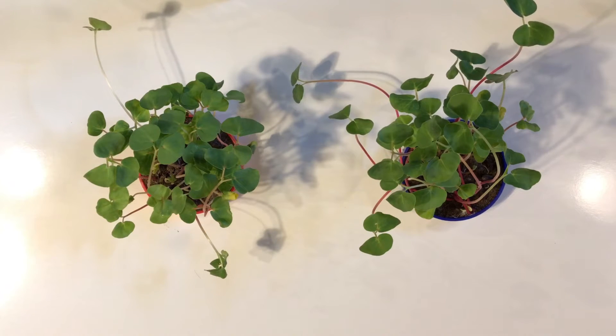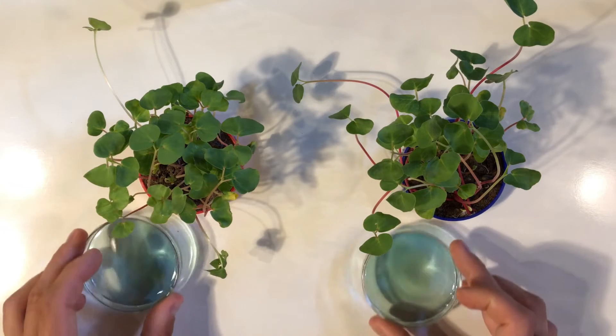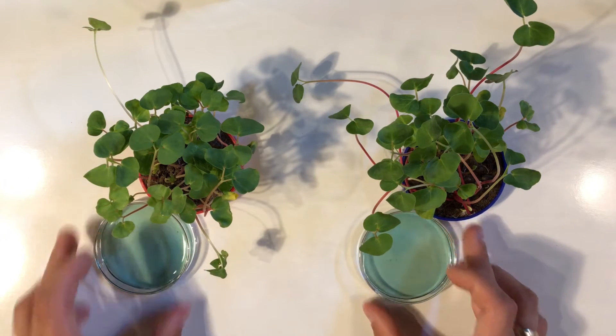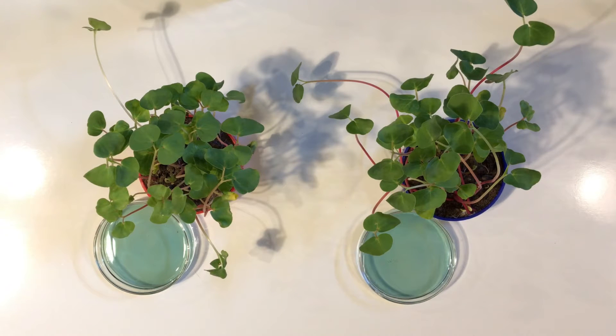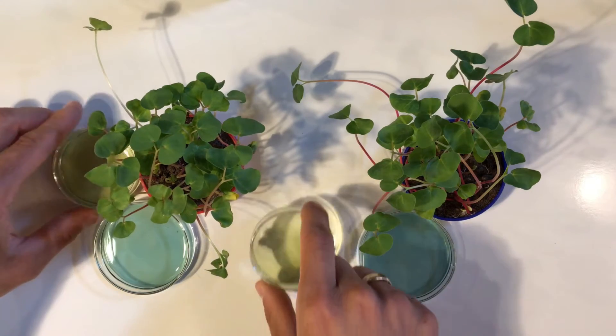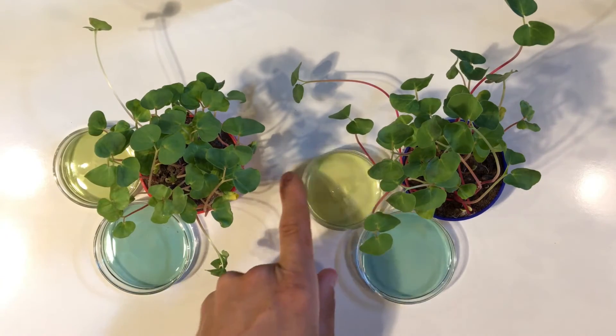We're trying to figure out what role light plays in the function of plants. Specifically, we want to see if light has any effect on the way that plants move carbon dioxide around. To accomplish this, let's take two identical groups of plants. Next to each one, we'll place some BTB. Since we don't really know how or even if the plants will influence the BTB, let's play it safe and put both yellow and greenish solutions next to each plant group.